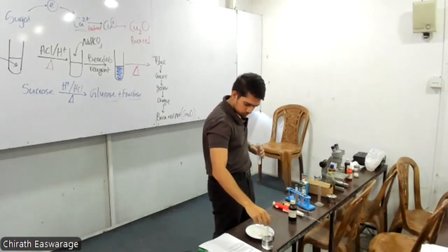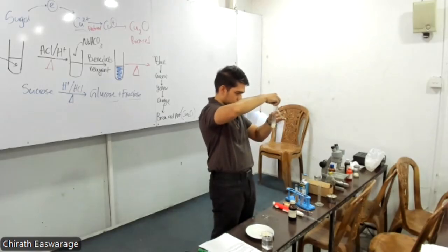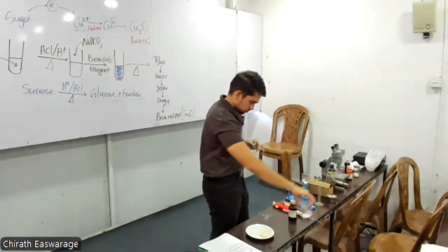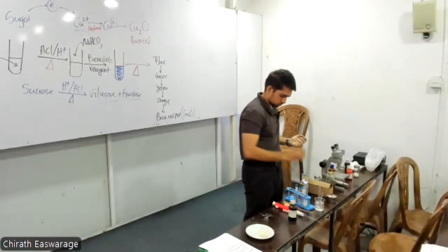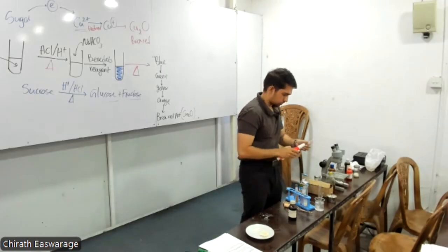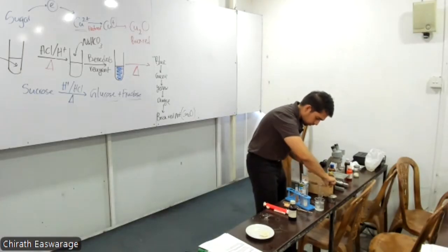The Benedict's one is that one, no? Yeah. Let's keep it that way. Let's use a separate one to add iodine.